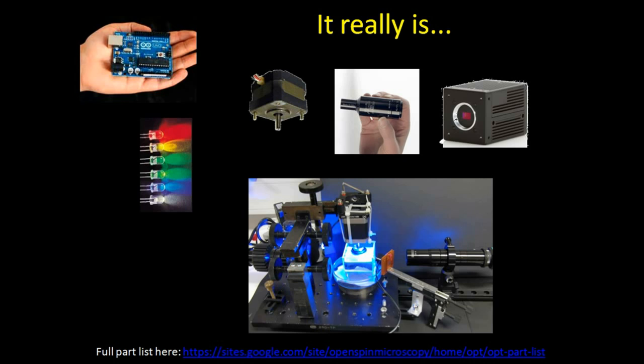It was used in the early 90s, I believe, to clear embryos, frog embryos. Frog embryos are fairly large, so they scatter light, and it's not easy to see them on a conventional microscope. If you embed them in BABB, you will see much better through it, and you see several layers of cells. So that's typically what's used in OPT. Samples that are cleared are submerged in this medium with BABB, and they're quite transparent. I'll show you an image of that in a moment.